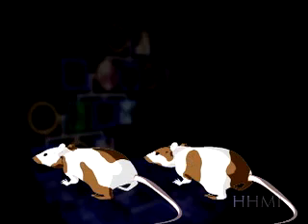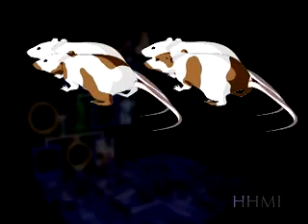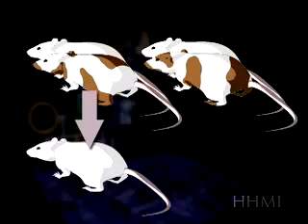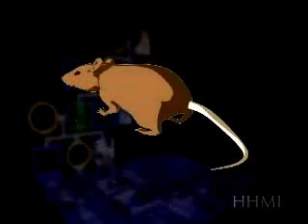To establish a line of mice with a new transgene, it is necessary to find chimeras whose germline cells, that is, sperm or egg cells, have developed from the injected ES cells. This is done by breeding the chimeras with albino mice. In some chimeras, the germline cells are not from the ES cells, and the offspring will be albino. In others, the germline cells are from the ES cells, and the offspring will be brown. These mice can be used to found the colony.